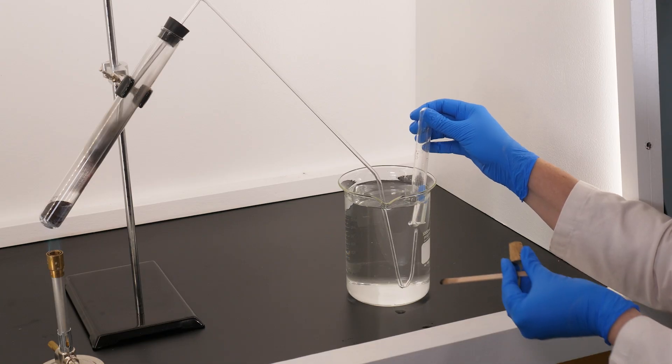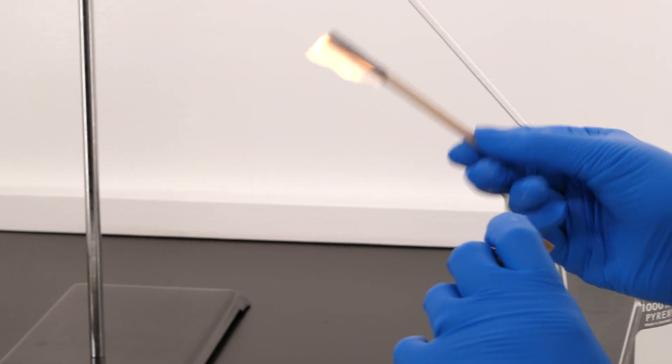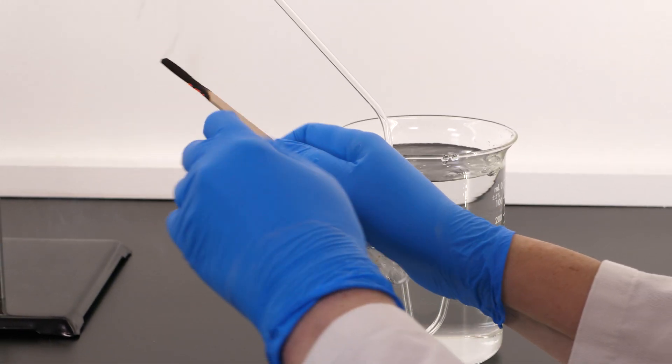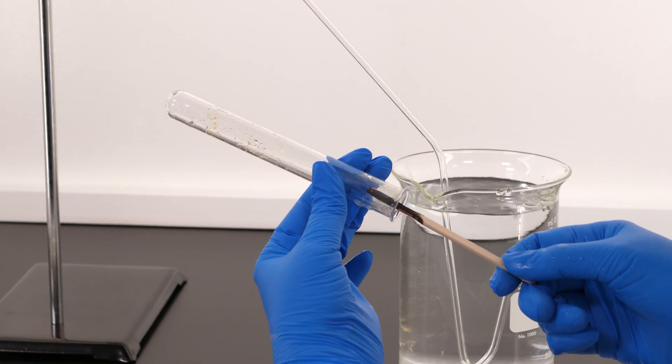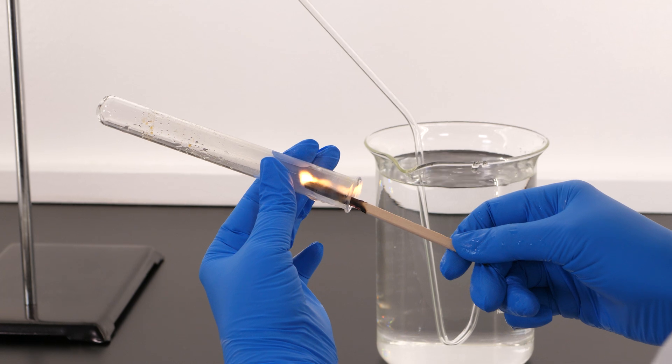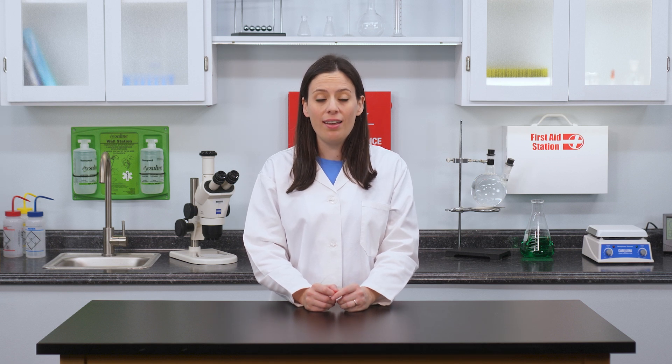Oxygen is an oxidizer that supports combustion. See what happens when we insert a glowing wood splint into the test tube. The fire reignites, proving the existence of oxygen. Through the process of thermal decomposition, the compound mercury(II) oxide has been broken down into two products, mercury and oxygen.